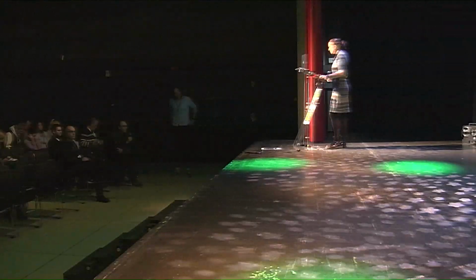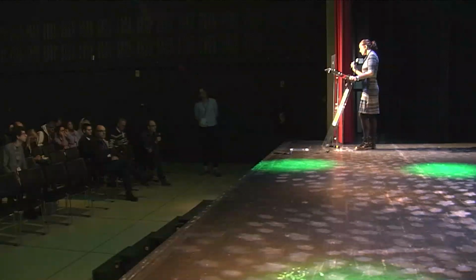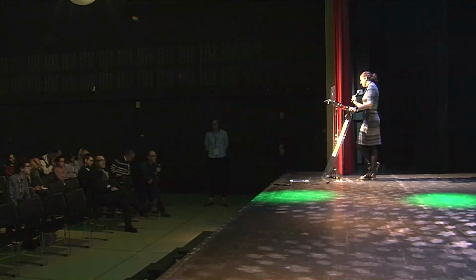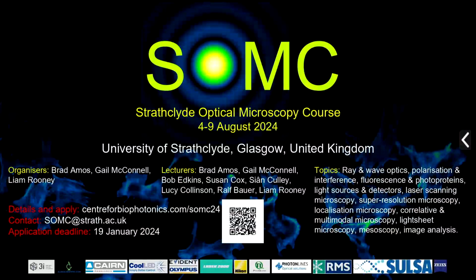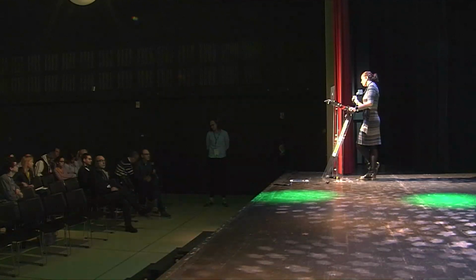Fantastic talk, thanks. I might have missed it, but what is the working distance of your Mesolens? Because this screams for expansion microscopy, right? We are interested in tissue blocks of around 1 millimeter, so if you expand them 4 to 10-fold, you need that type of working distance.